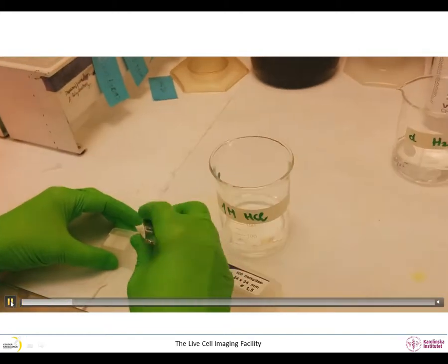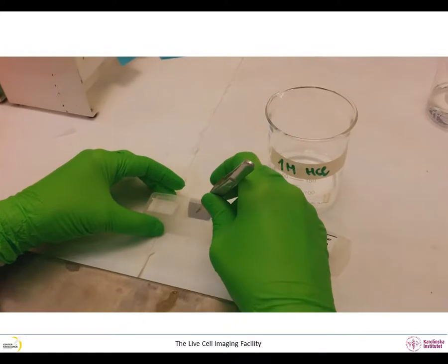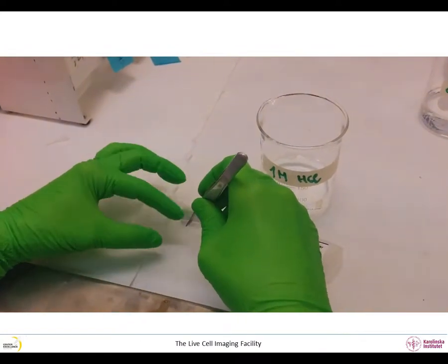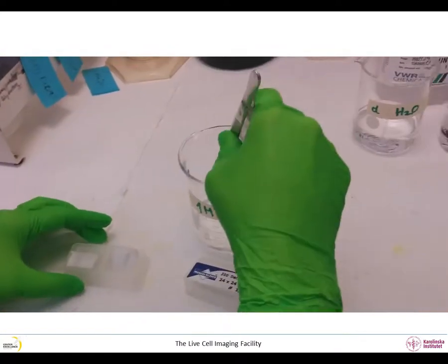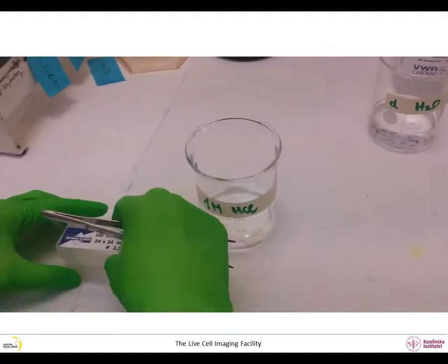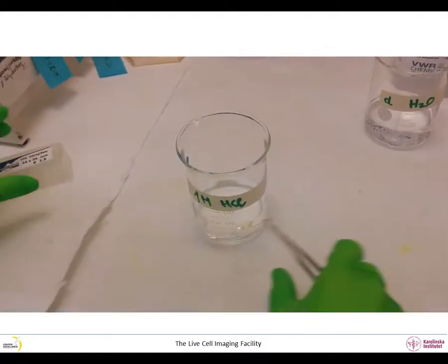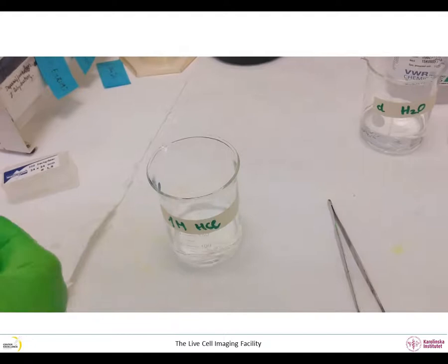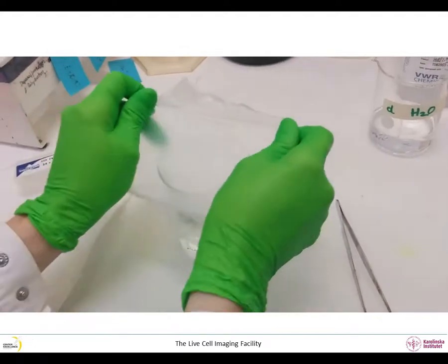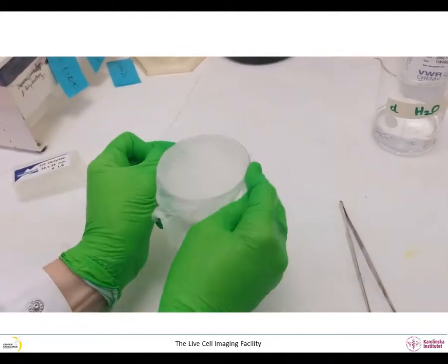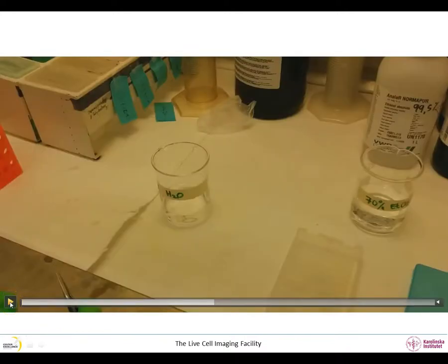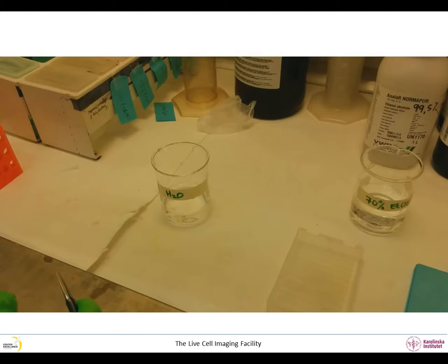Make one molar hydrochloric acid solution in a glass container and put the cover slip in it and leave them in this solution for a couple of hours or overnight. This hydrochloric acid solution can be reused several times for several cleanings. After carefully decanting the acid, wash the cover slips extensively in distilled water.